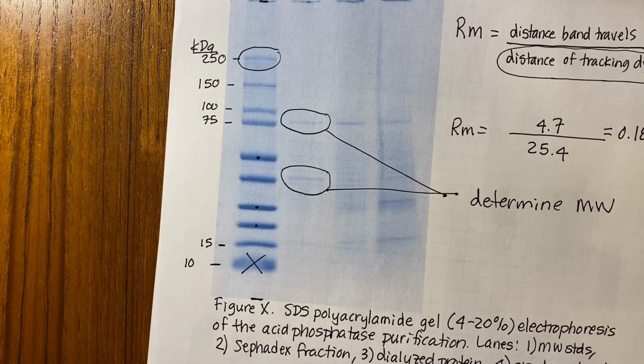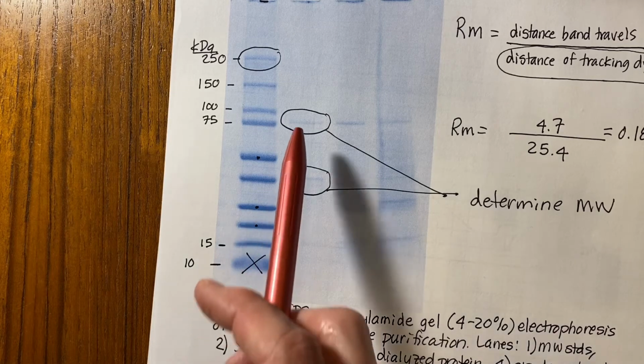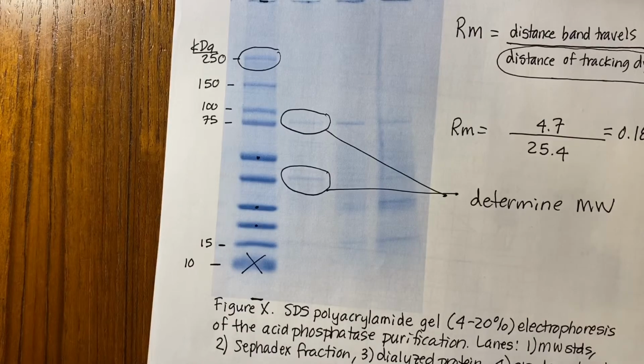But for the other band, you should look online and use the internet to find out if there are other acid phosphatases that have a different molecular weight. Because if there are, you could assume you've isolated 2 different acid phosphatases. If there aren't any other ones that match your molecular weight, you can assume it's a contaminant. So that's something you should look up to put in your discussion.